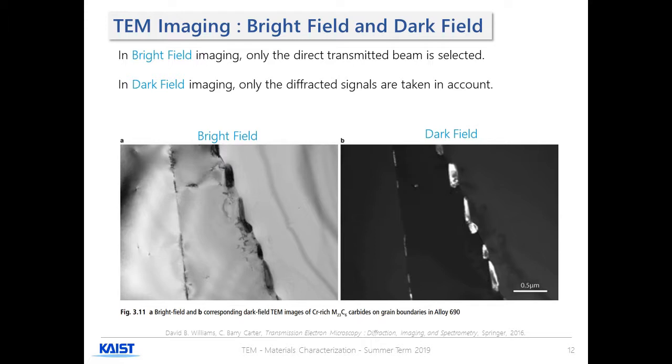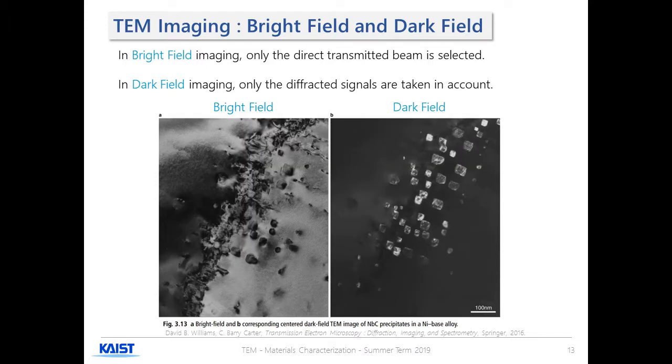Hence, on the example below, dark field allows for excellent contrast by highlighting diffracting elements of the sample, while bright field images are the closest you can get to obtaining an actual picture of your sample. In the following section of the presentation, the optics of the TEM instrument will be detailed, and several examples will be showcased.